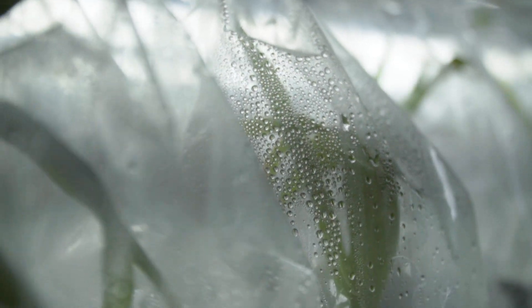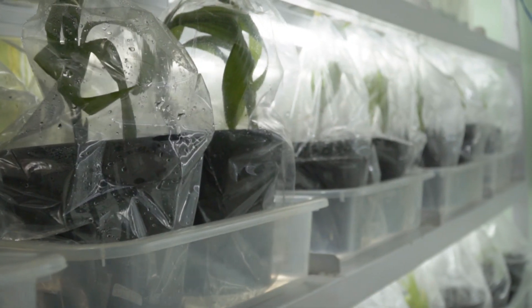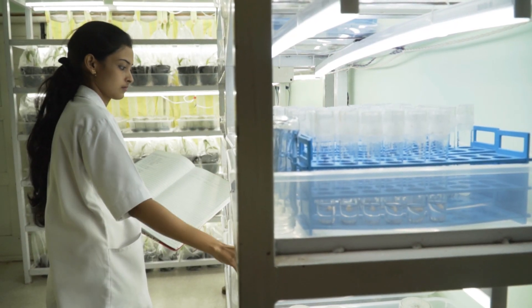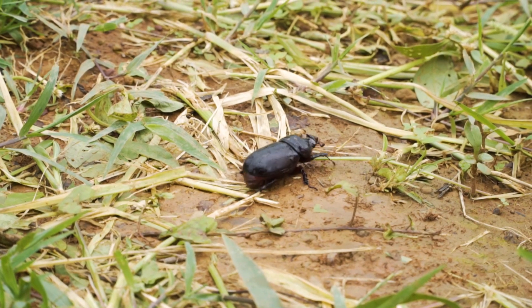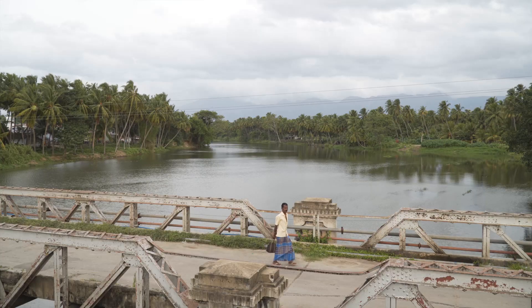One more advantage of the embryo culture plantlet is that it fulfills quarantine conditions very easily. Because it's grown up in the lab, it's free from any disease, bacteria, or pest, and it's acceptable by most importing countries.